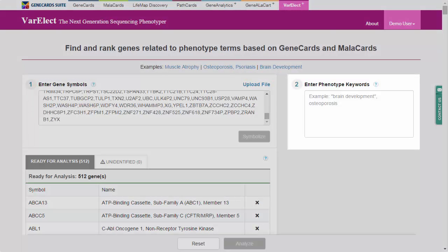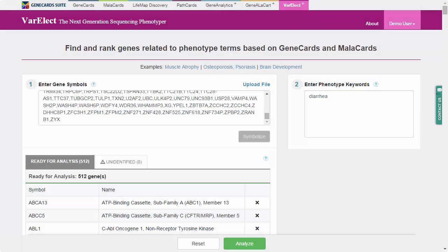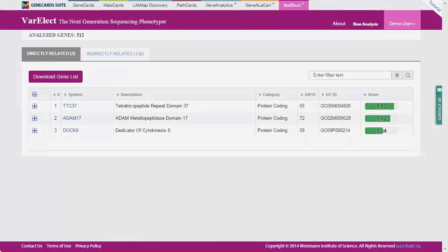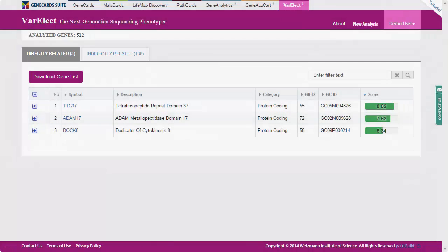Let's enter diarrhea as our phenotype. We can also enter a set of phenotypes with Boolean conditions for more advanced analysis. Let's click on Analyze to begin our analysis. Varelect's result page is comprised of two tabs that display subsets of the input genes according to their relevance to the phenotype diarrhea.